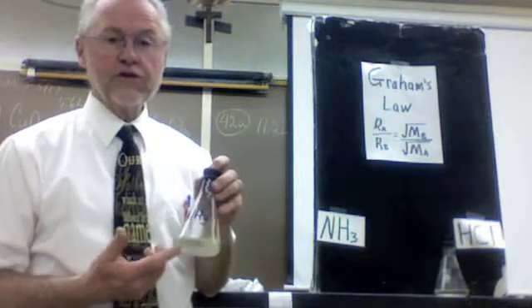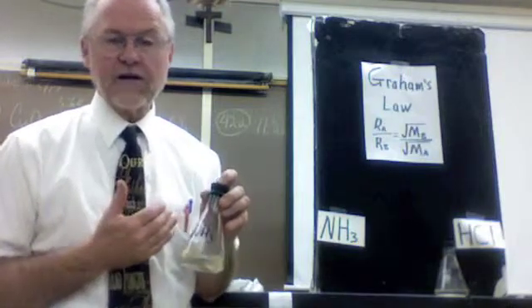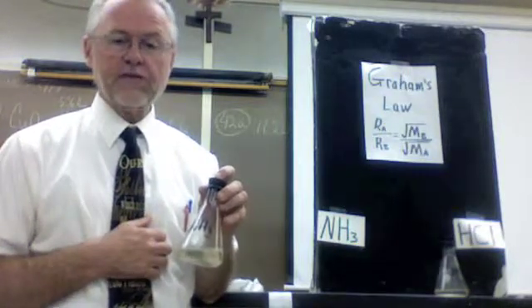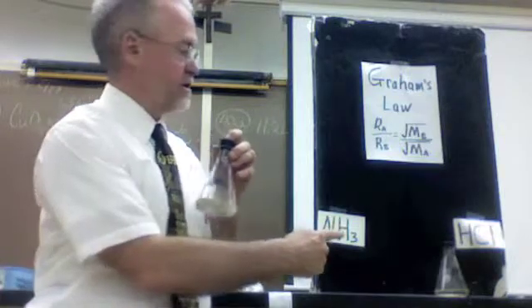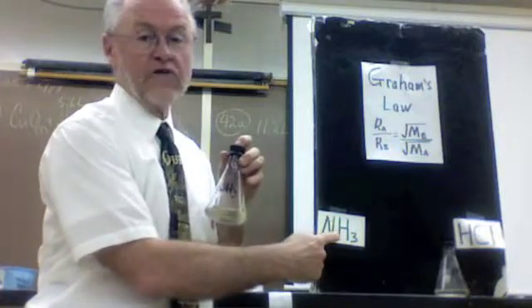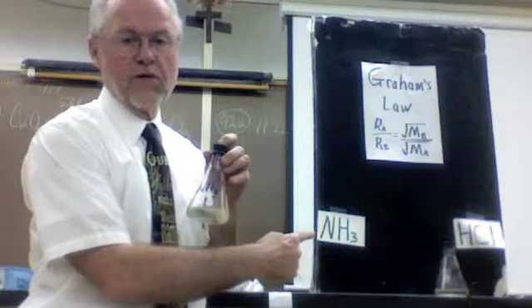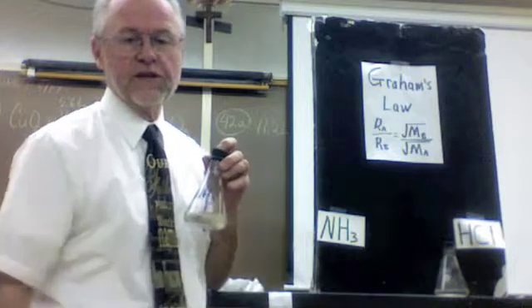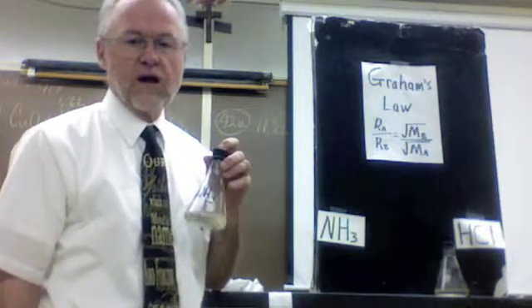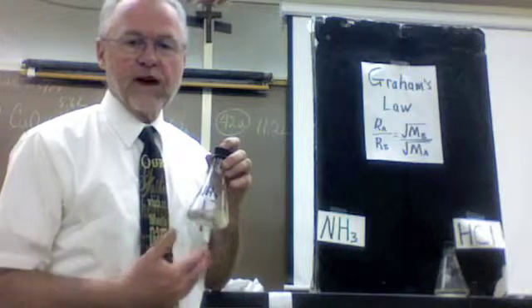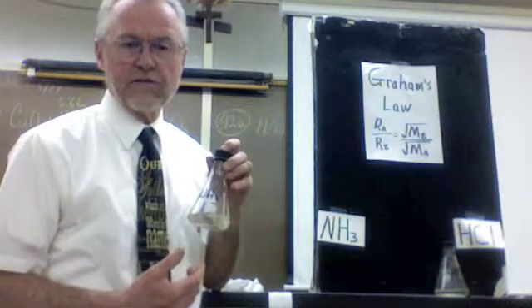I'm going to let these gases out. The interesting thing is where the gases meet — where ammonia meets hydrochloric acid — a new product is formed: ammonium chloride, which can be seen. It's a white solid. So that reaction can be classified as one of the five types of reactions.